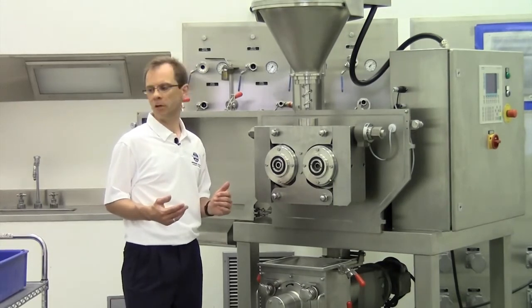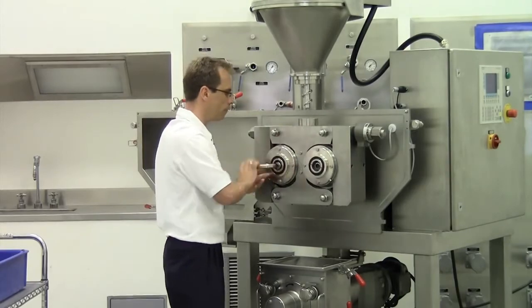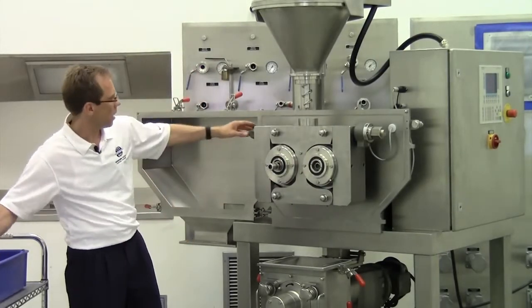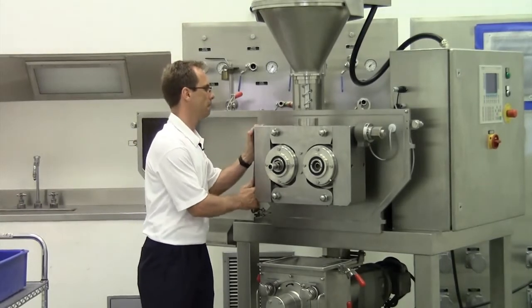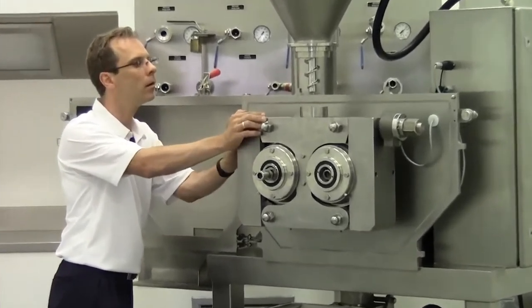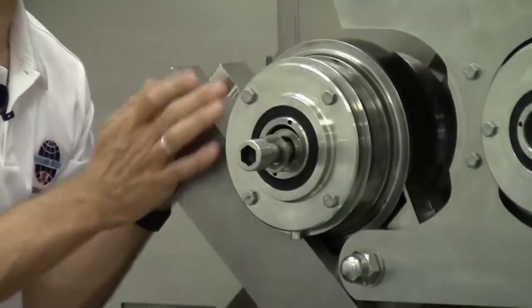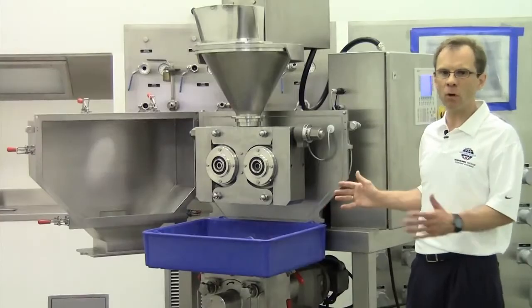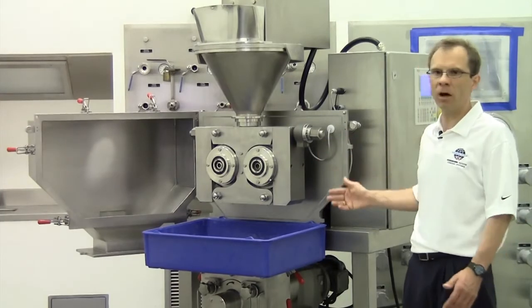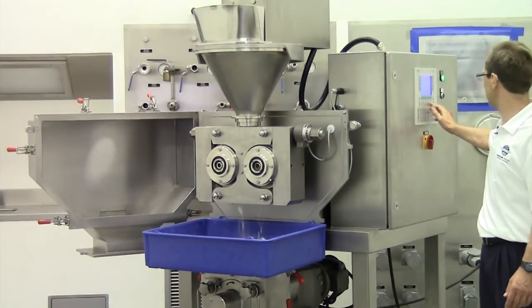So this is something I'd like to demonstrate for you. First of all I have to open the coupling. After that I can also open the nut here. Now easily the roll can be taken out of the machine. This is only for demonstration purpose — normally you would never run a machine with an open lid because it's dangerous; there are turning parts and dust can come out of the machine. Now I'd like to start the machine, starting with the rolls and the screw.